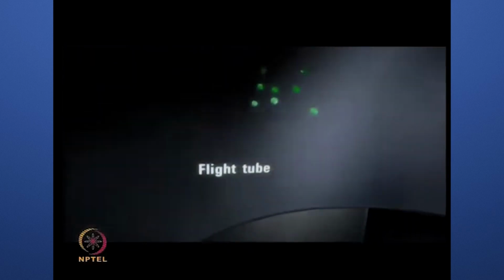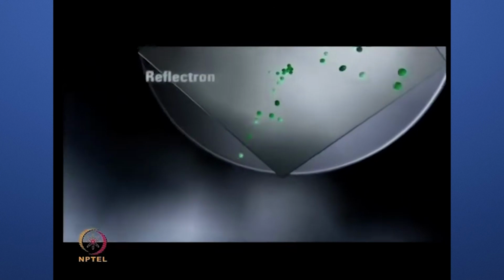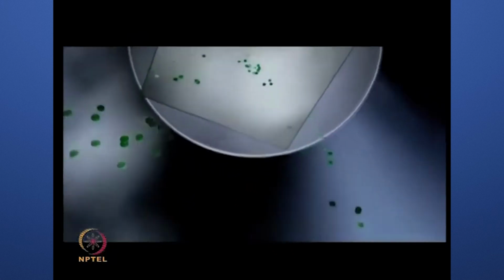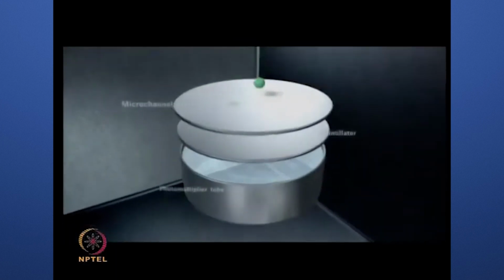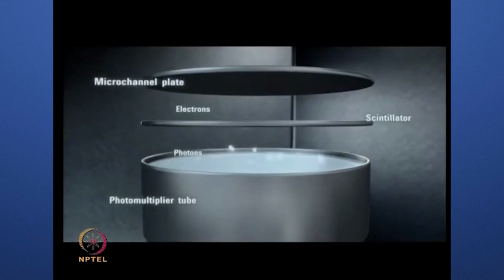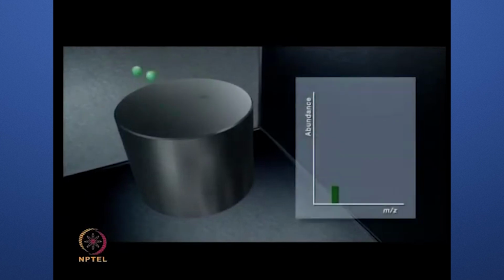The flight tube is constructed of special materials with very low coefficients of thermal expansion, so it is less sensitive to temperature changes. The reflectron compensates for minor velocity differences, improving the resolving power of the 6510. The microchannel plate detector converts the ion signal from electrons to photons and back to electrons. This electrically isolates the high voltage flight tube and front of the detector from the signal passed to the electronics.